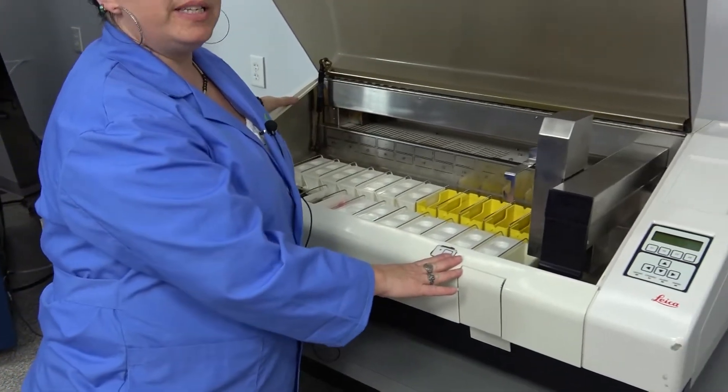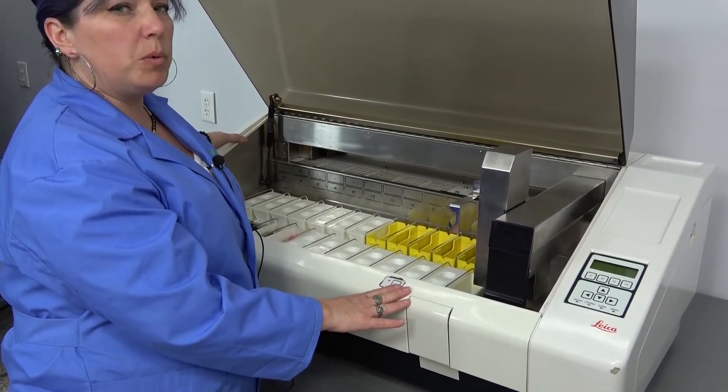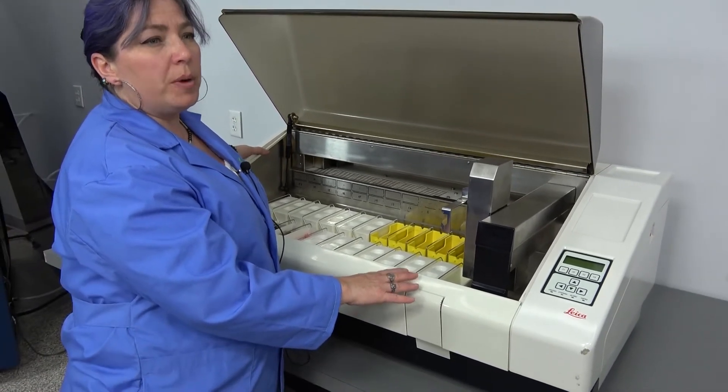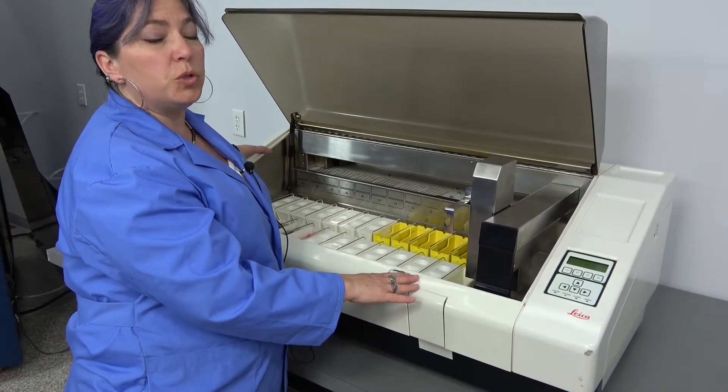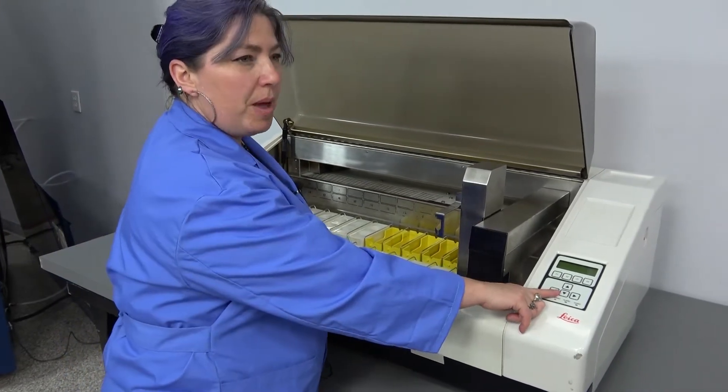This auto stainer is really nice. It will not start a stain protocol that is incompatible with the stain protocol that was entered before it, but it can run up to 15 different programs and can be stored in the memory.